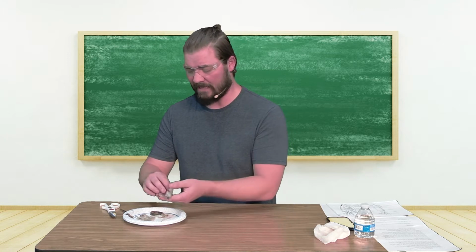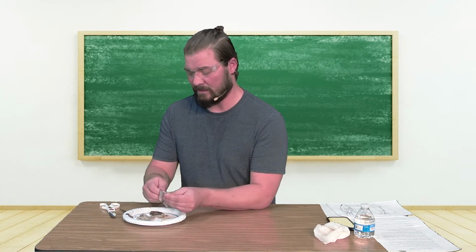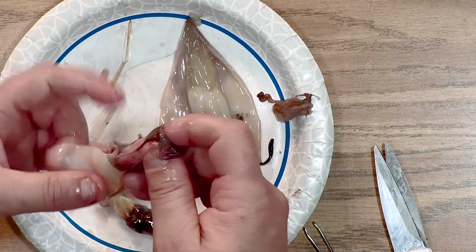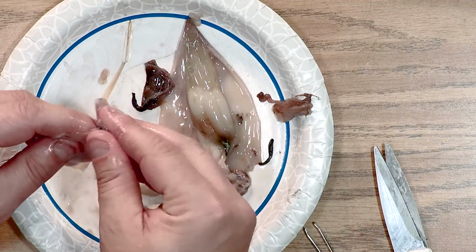All right, so I'm coming back into this, and then I highly suggest taking this, and you can actually separate the fins and the skin here on it from the mantle pretty easily.